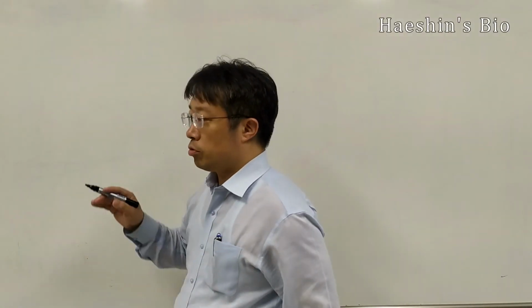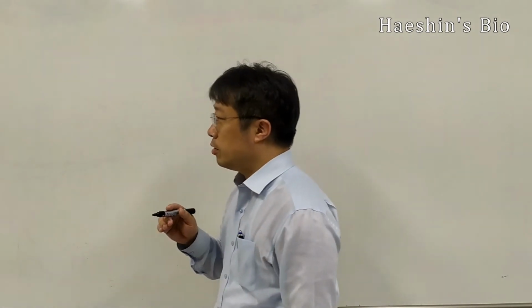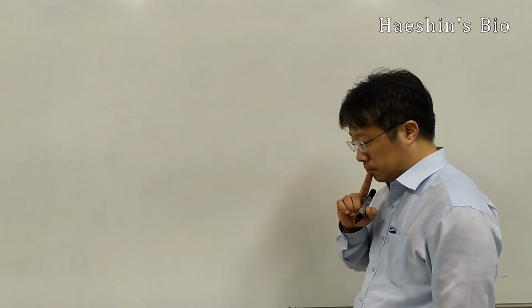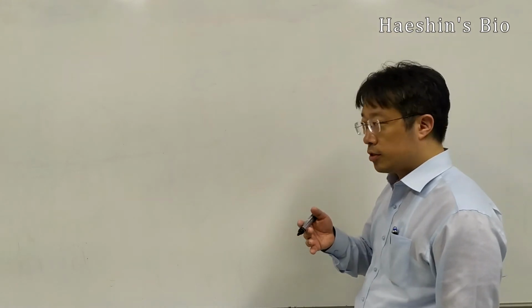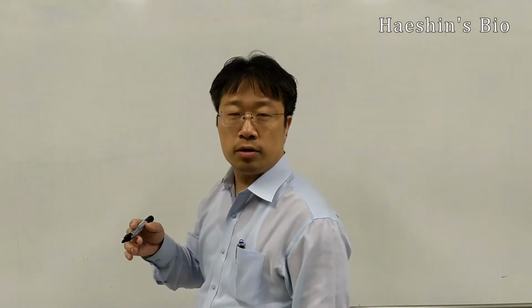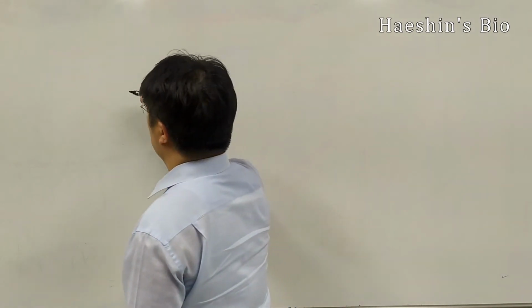Okay, so we talk about the XPS signals and then peak and peak shift, chemical shift. So let me give you some examples. We have to remind the tables that I presented before, which I gave you as class materials.